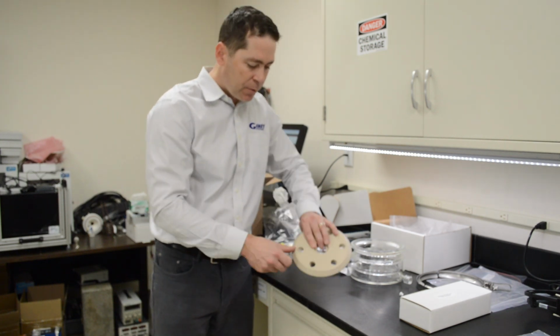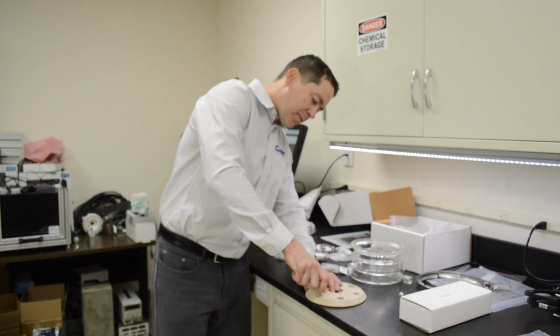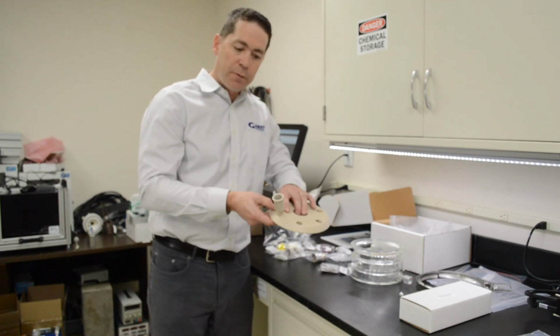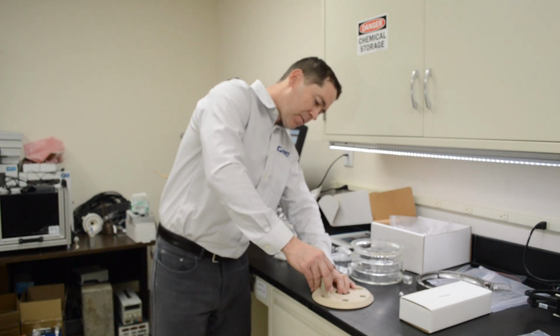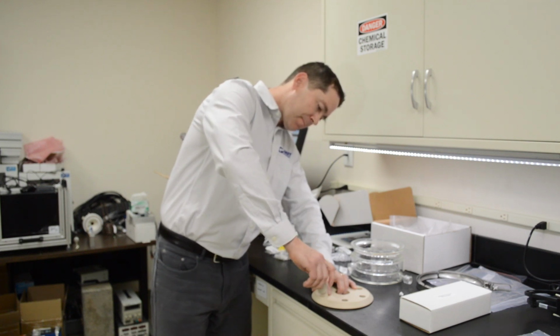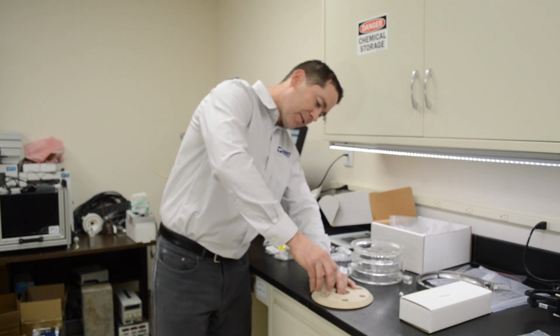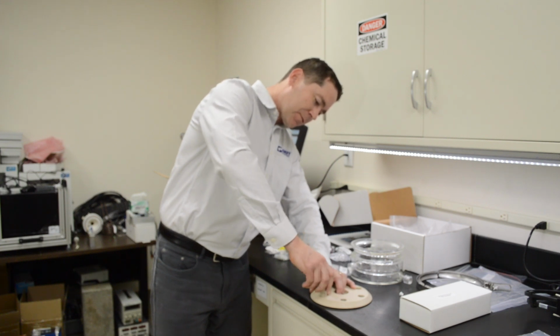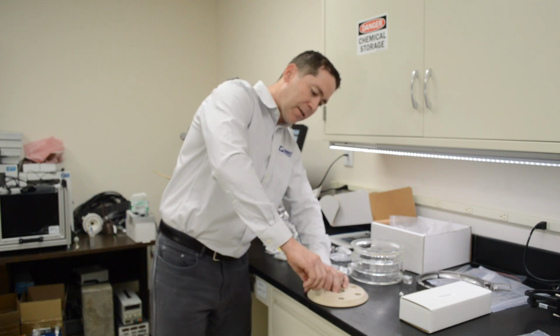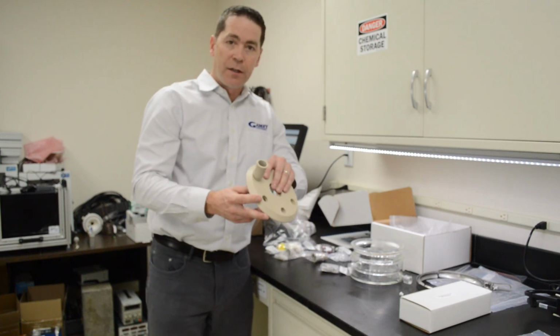So you can see how that adapter went all the way down to the bed of this port. If you don't, you can already see I can feel resistance with just the first few threads. So it's important to apply that side pressure. As you can see, getting these threads lined up properly takes a little bit of work. So that's one of the difficulties of machining PEEK. There we go. At an angle especially, it's about making sure that your threads can all get lined up properly.